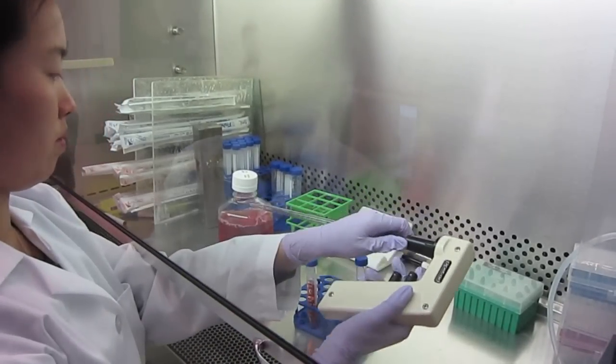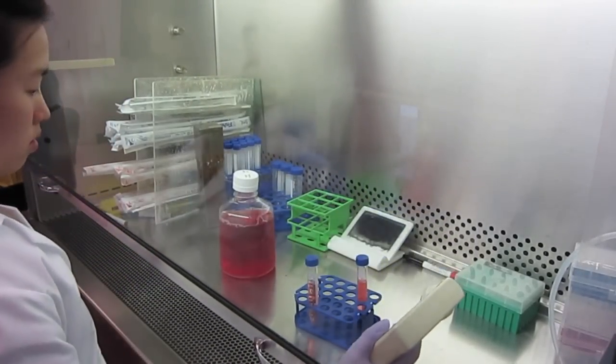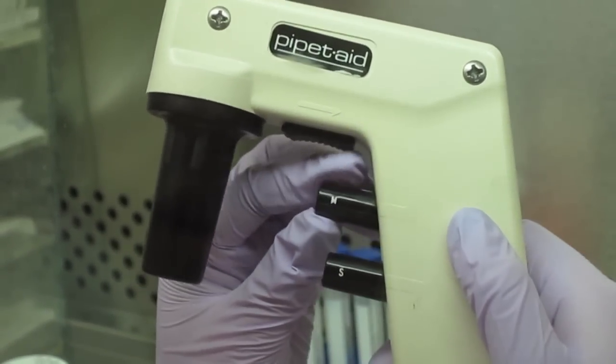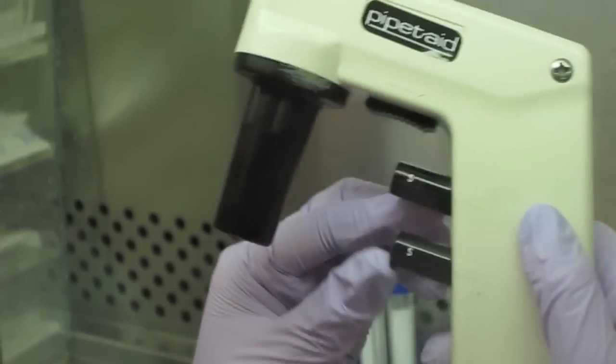When pipetting, it may be useful to adjust the aspirating and dispensing speeds. F for fast, M for medium, and S for slow.